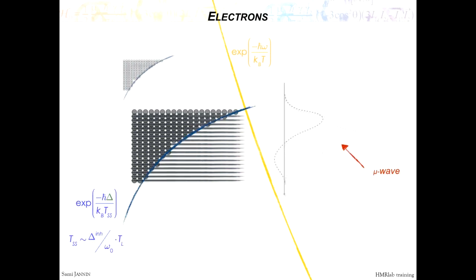And then you apply microwave, and what spin temperature theory, or saturation theory from Provotorov, says is that instead of digging a hole, you saturate the spins right at the frequency here, but then you create this very strange dispersive shape in the EPR spectrum. This means that you will reorganize the spins according to an exponential law, a spin temperature in the rotating frame. So you saturate and the spins go like this.